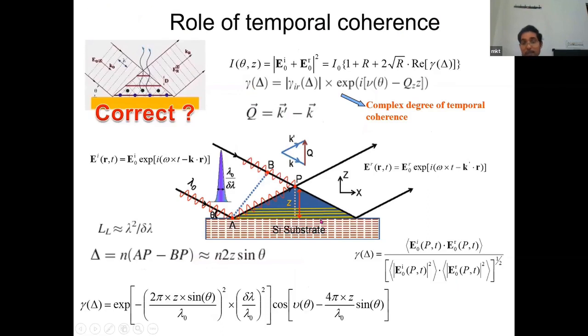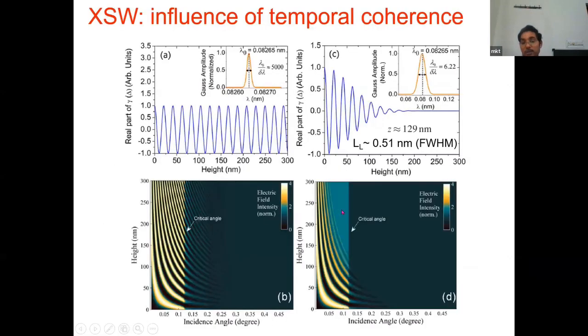Up to a certain height, the two beams interfere, and after that they do not interfere. They just make the sum of the two terms. That is two terms, double intensity. Here it is four times, or slightly changes, so from 0 to 4, 4 to 2 times, and also 3 times, 4 times, 2 times. So this is what we should take into account.